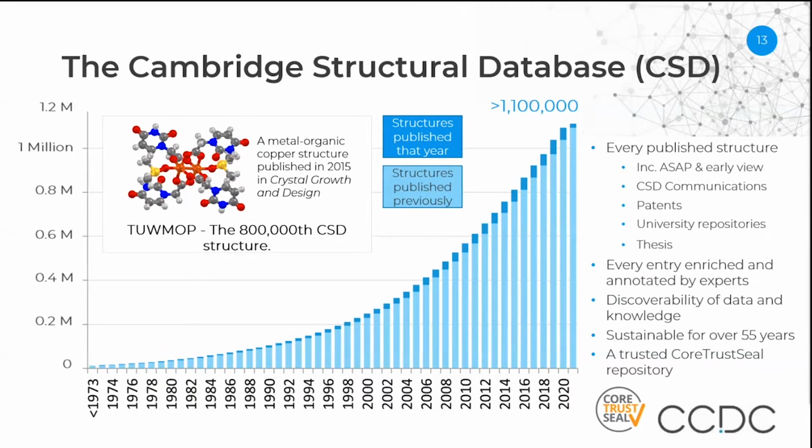You can see the growth of the CSD since 1972 here, and one of our milestone structures. This is a copper paddle wheel structure, and it was the 800,000th structure added to the CSD back in 2015.